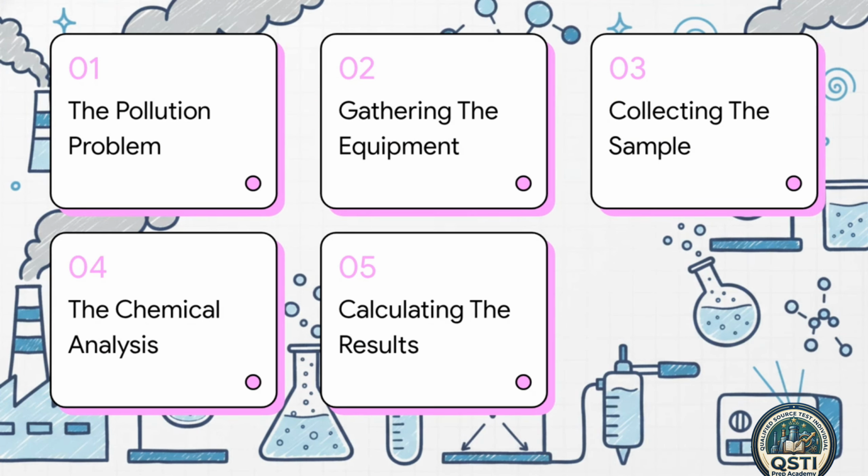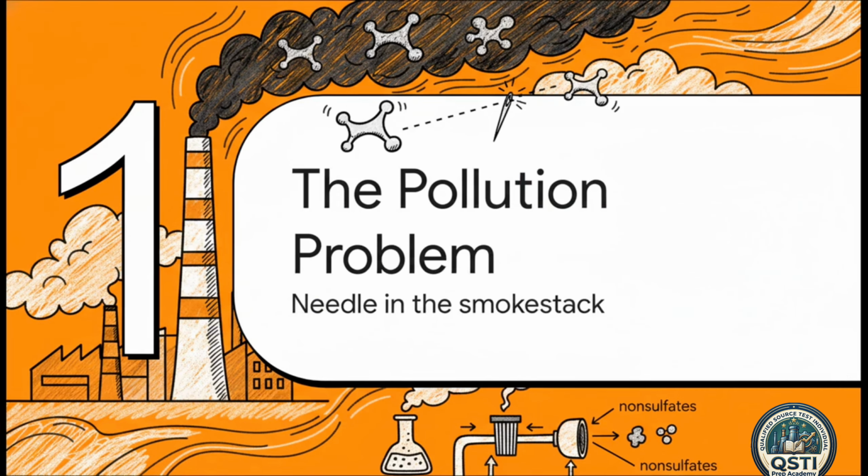To crack this case, we've got a really clear 5-step roadmap for today. 1. The pollution problem. 2. Gathering the equipment. 3. Collecting the sample. 4. The chemical analysis. And finally, 5. Calculating the results. Okay, let's dive right into this.